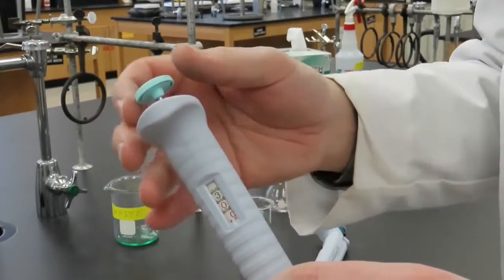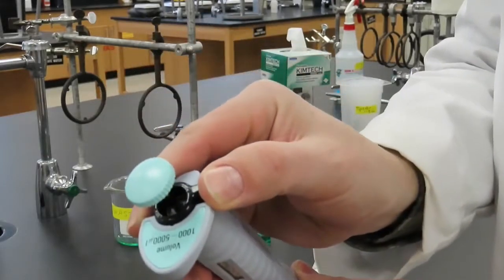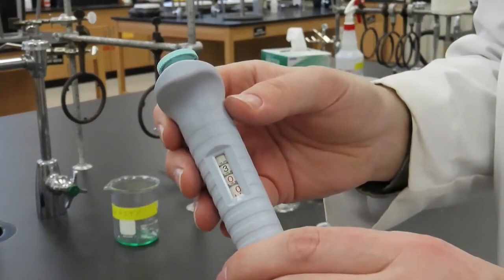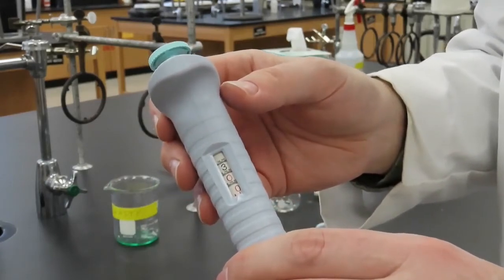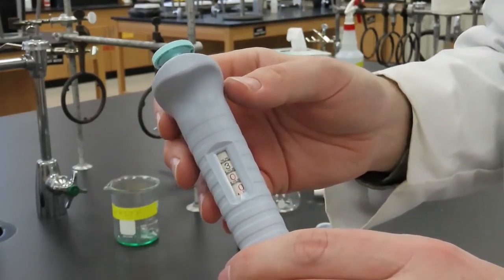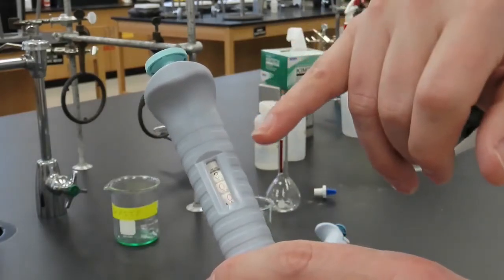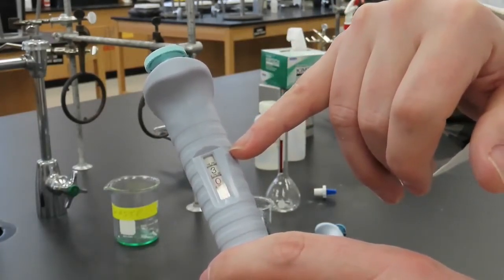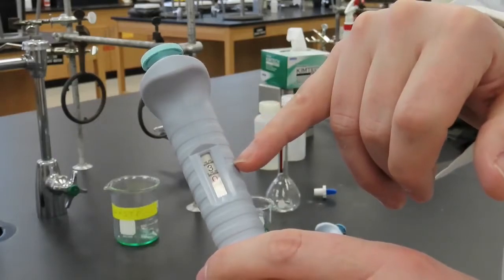To adjust the volume, we first unlock the volume locking ring. The display shows the volume the larger micropipette is currently set at. For this pipette, the black digits represent the whole milliliters and the red digits represent tenths and hundredths of milliliters. Therefore, the volume is currently set at 3.00 milliliters.